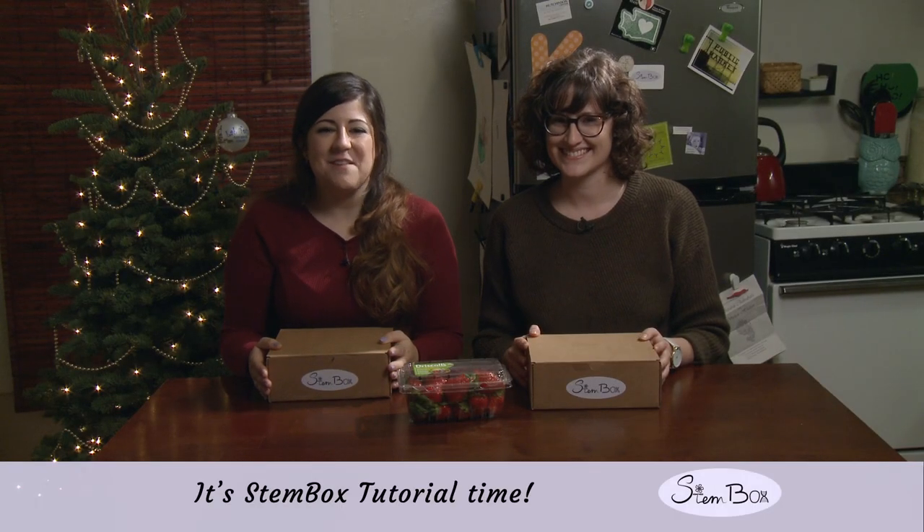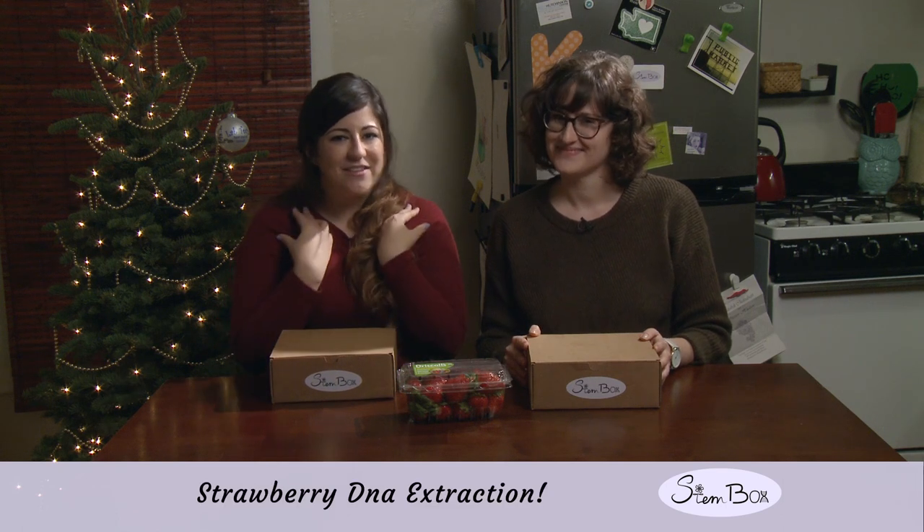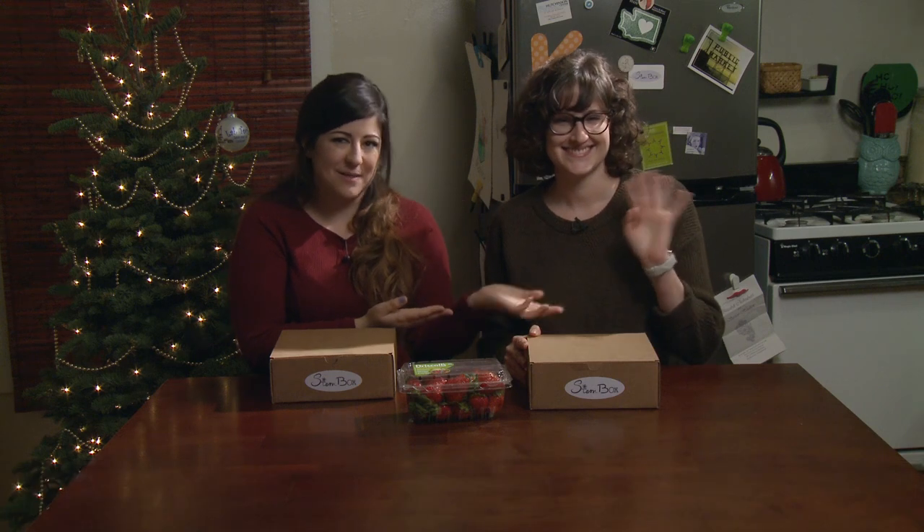Hello and welcome to the first Stembox tutorial. Today we're going to be doing a strawberry DNA extraction. I'm Keena, founder of Stembox, and this is Caroline, our social media specialist.